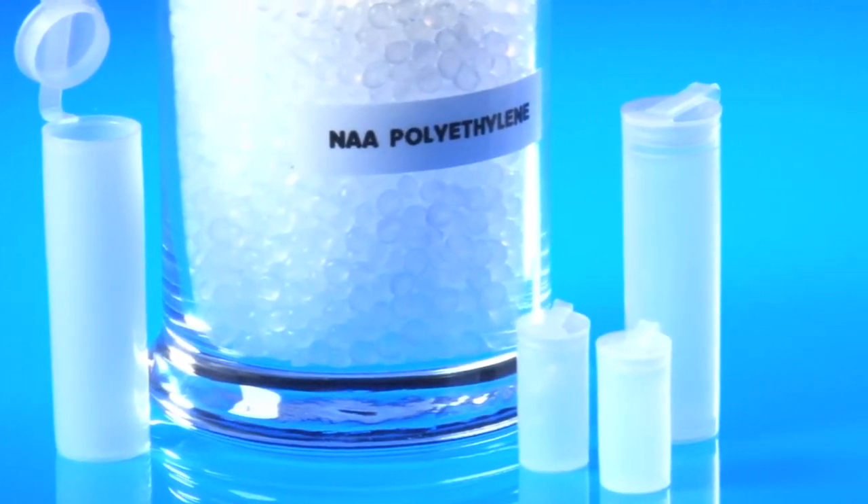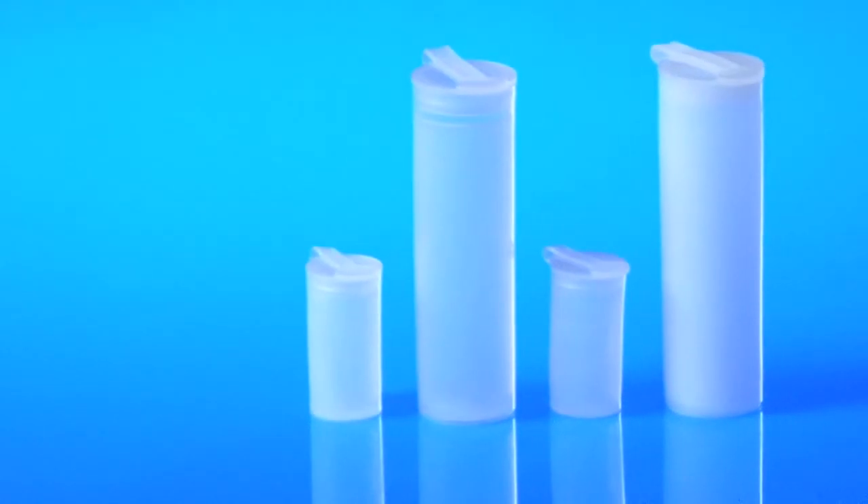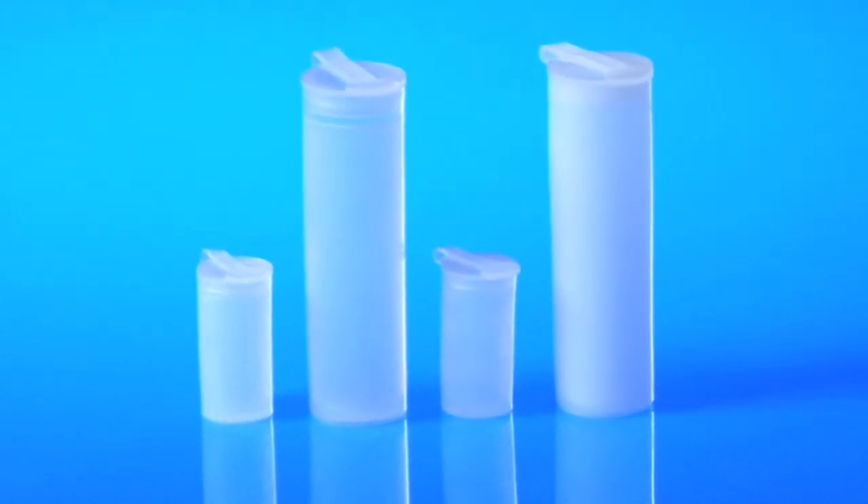LA Container offers two container sizes in the polyvial line that are specifically engineered for neutron activation analysis. The EP338 and EP290 are manufactured with a specialized NAA polyethylene that features good impact strength. The design of these plastic vials includes thicker walls that provide good tensile strength to protect samples during transport and activation.